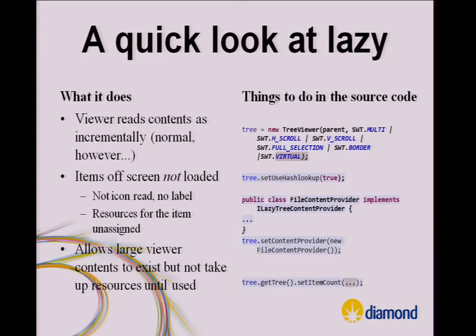We use something called a gallery from Nebula, which also has a virtual flag on it. That way we can have, let's say, 10,000 images or 10,000 whatever, but they're not taking up memory and resources.